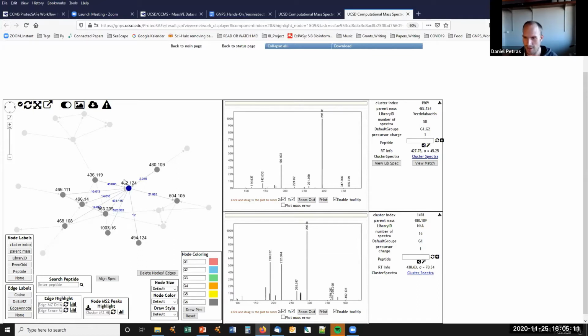So now, I hope that Ming joined us, because I invited Ming as a special guest for this, because we want to showcase one of the new tools. Is he in the list? Yeah, Ming, why don't you take over here and showcase the LCMS viewer?